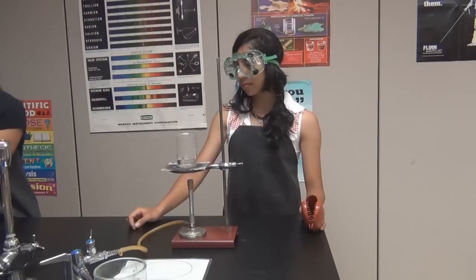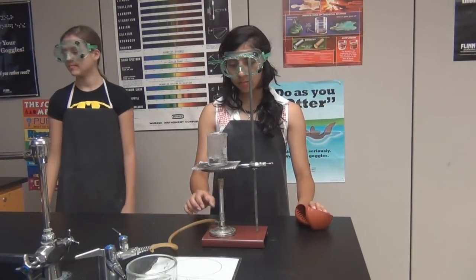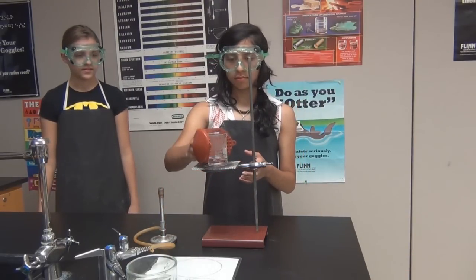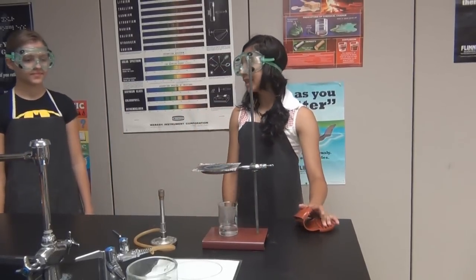How to disassemble a Bunsen burner and ring stand. First, turn off the gas. Then move the Bunsen burner onto the lab table. Using a rubber mitt, take the beaker off the wire gauze and place it on the base of the ring stand. Be very careful with liquids.